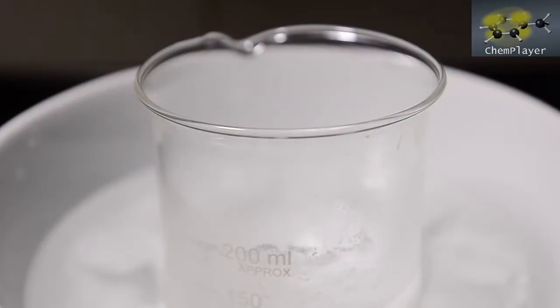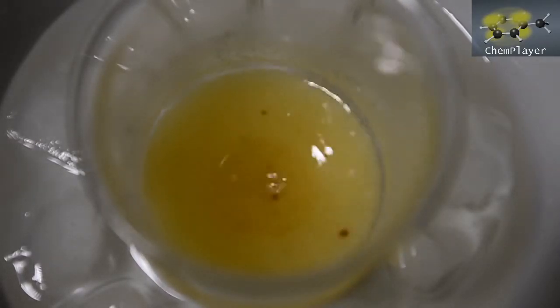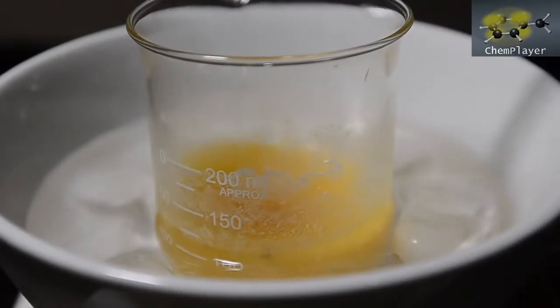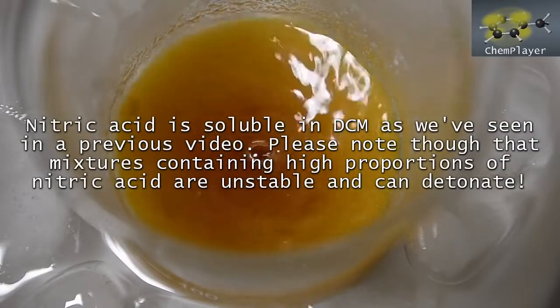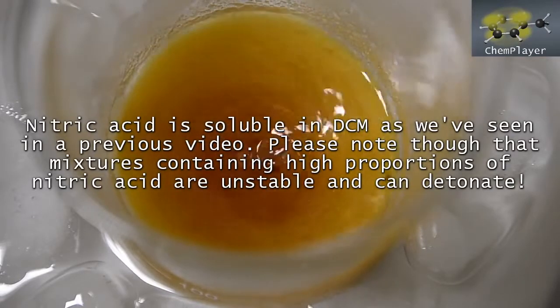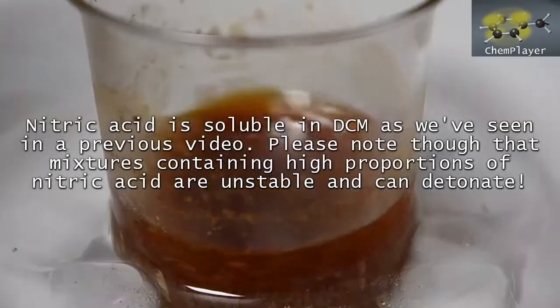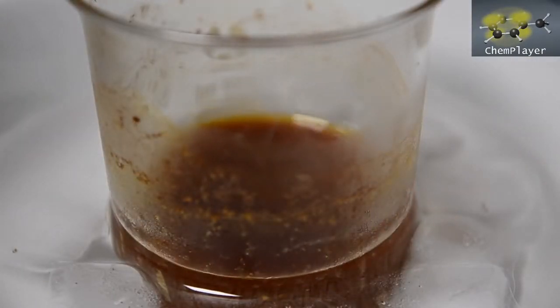So let's try it out. There's an immediate yellow color produced, and the aqueous blobs in the stirred mixture turn red. We'll keep adding slowly. Another thing about dichloromethane is that nitric acid is pretty soluble in it. Although there's some water in the nitric acid we're adding, it's likely that some of the pure nitric acid is passing into the DCM layer containing the vanillin.